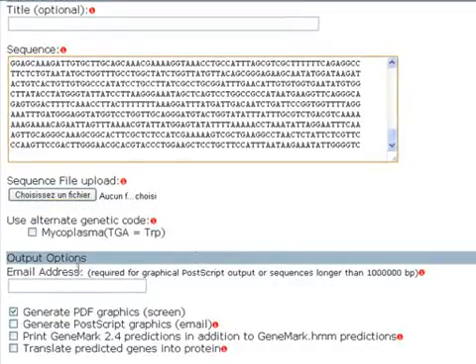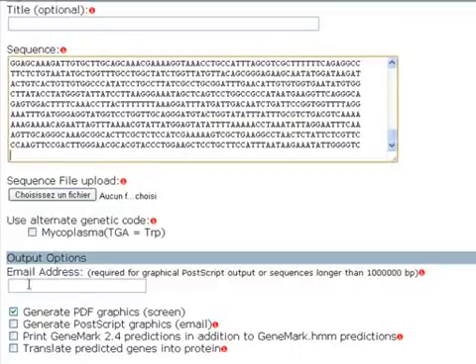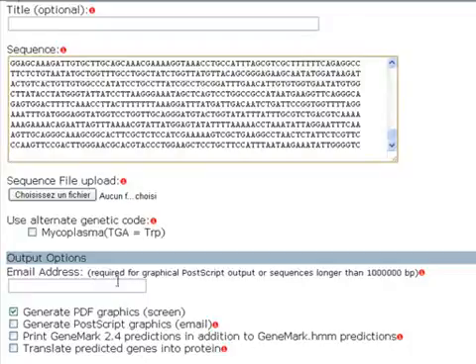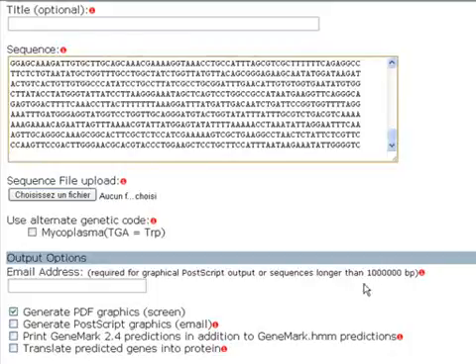From the output options section you can enter our email address here. They say that it's only required for graphical postscript outputs or sequences longer than one million base pairs.